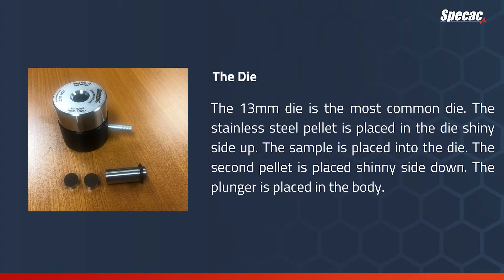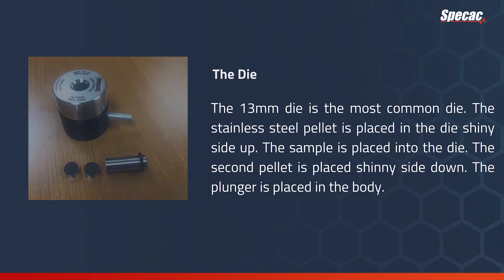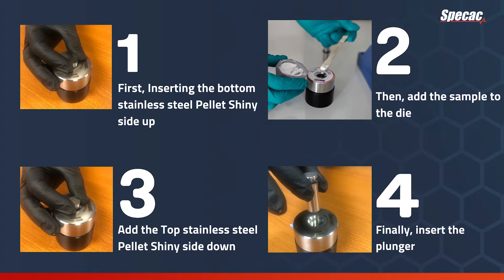About the die: the 13mm die is the most common die. First, insert the bottom stainless steel pellet shiny side up. Then add the sample to the die. Next, add the top stainless steel pellet shiny side down. Finally, insert the plunger.